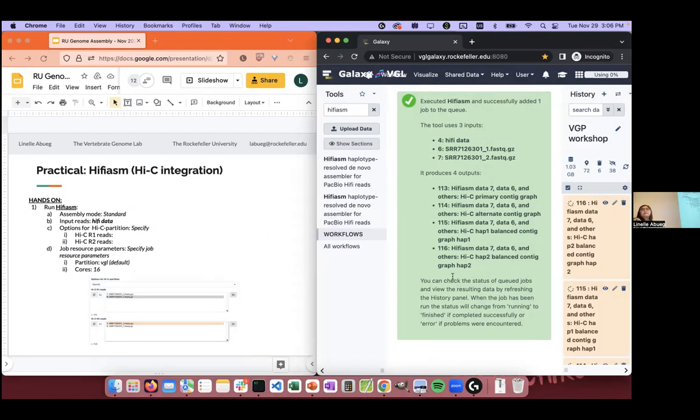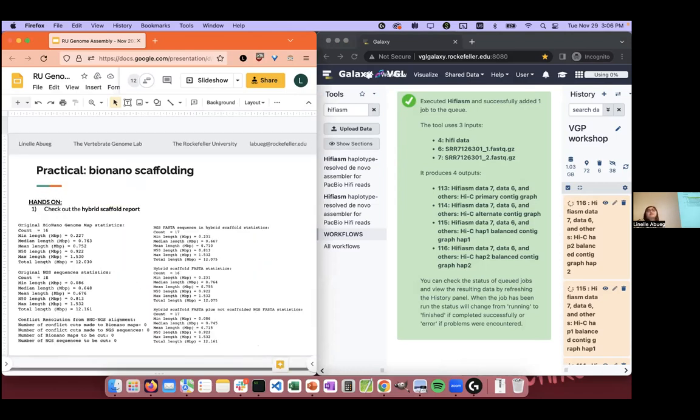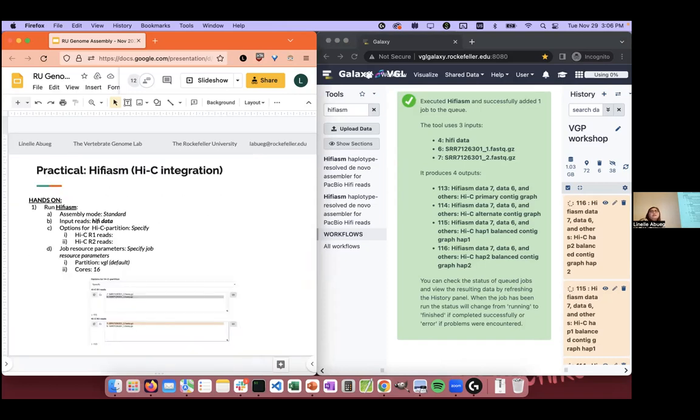So in the QC, yeah, and then they can see it. Then we go through the scaffold. And then it's like your scaffold, I'm not sure in the file. Yeah, no. And the practical and then the curation. Yes.